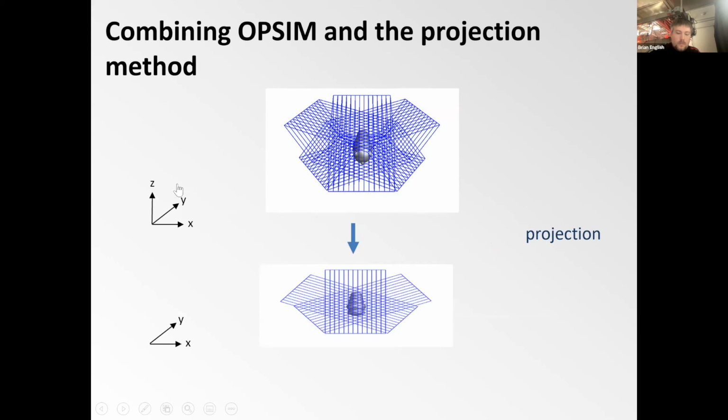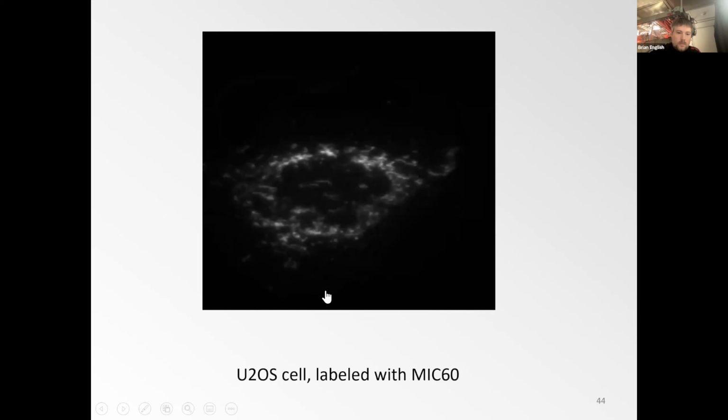It's important that they're precisely projected. If their angle would differ, then stuff that is higher up couldn't be registered because it would be angled away or in a different location for the different views. So this is a technical challenge. Nevertheless, for the SIM fans, I wanted to show this quickly.